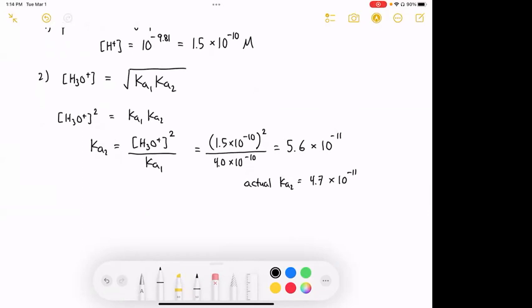And then lastly, you would calculate Ka2 for each trial and determine the average Ka2, calculate the standard deviation for Ka2, then calculate the 95% confidence limit for Ka2, upload to Hayden-McNeil, and then you'll be all done for this lab. Okay, so that is that experiment.